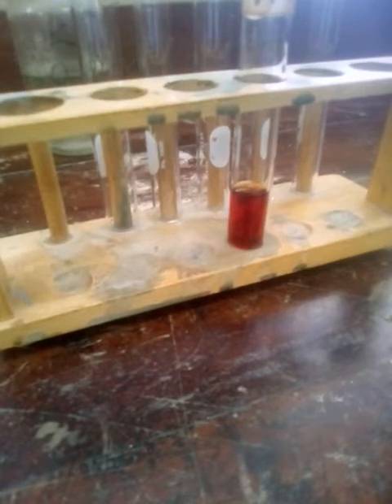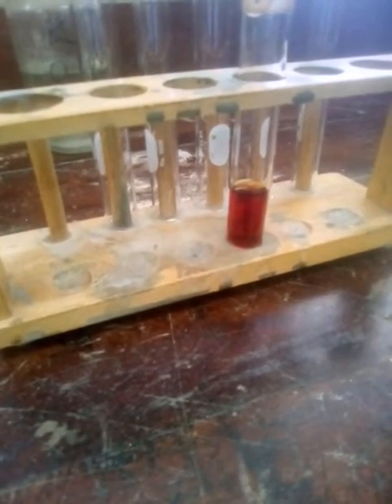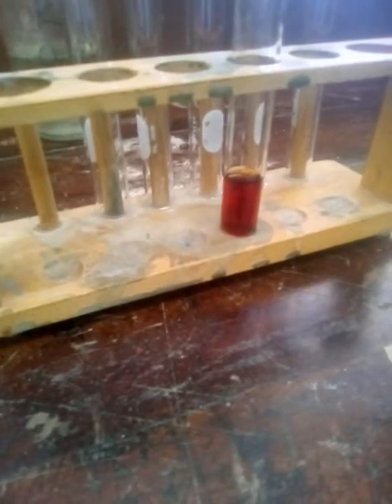Remember, these are diluted forms of the reagents. The hydrogen peroxide was diluted; the concentration was 6%, and the potassium iodide was also in a diluted form. So they were not concentrated reagents.